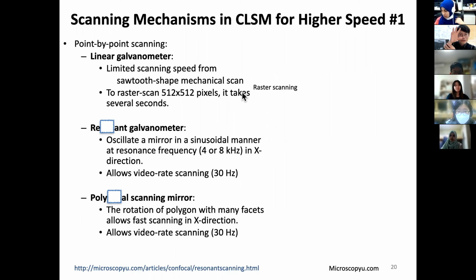So one way is very fast movement can happen when this mirror is at its resonance mode, which means at its resonance, it can move very fast. So one of these X and Y. When we make an image, usually we move X and one layer down and Y1, XY2, like this way. So think about X requires a faster scanning compared to Y, because Y kind of stays once, have to wait until you have the 1X.